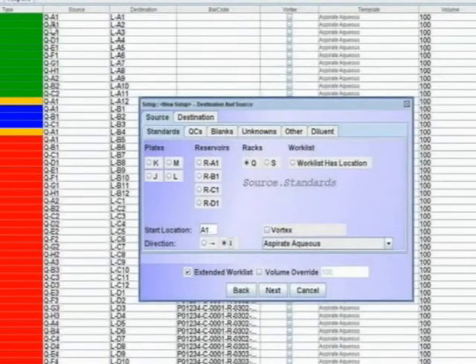However, in this deck layout, a 4x8 rack was used for the Q rack. Thus, Standard 1 through Standard 8 can go in the QA1 through QH1. However, Standard 9, Standard 10, and Standard 11 must go in the next row, QA2, QB2, and QC2.